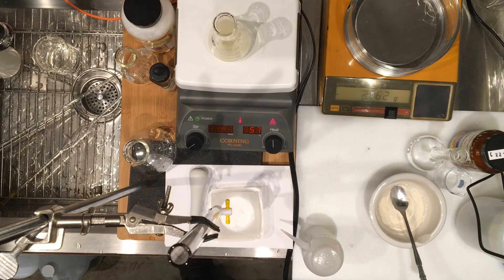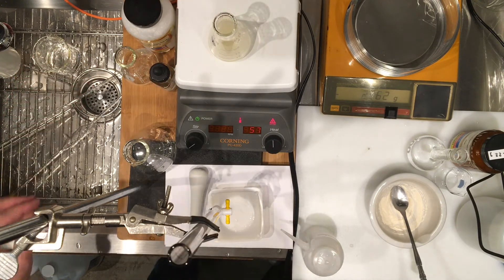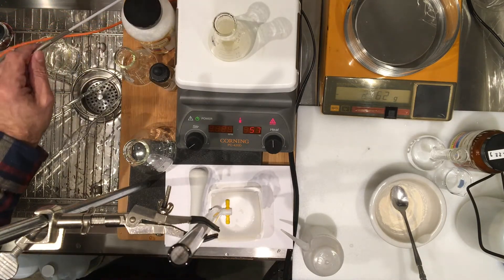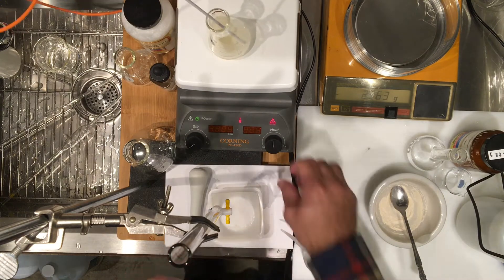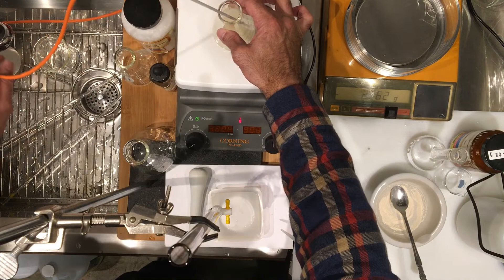I already have my hot plate on. The temperature isn't really critical — I have a thermometer in there but I don't really have to measure the temperature.